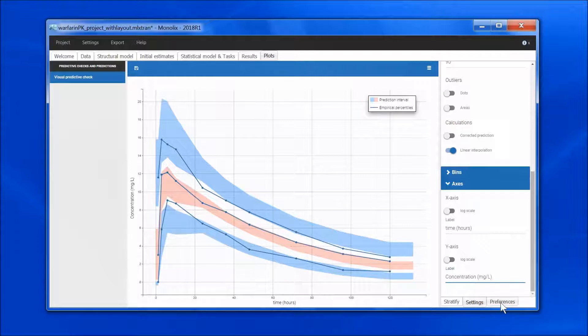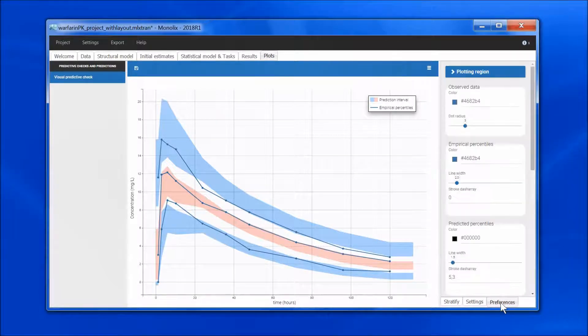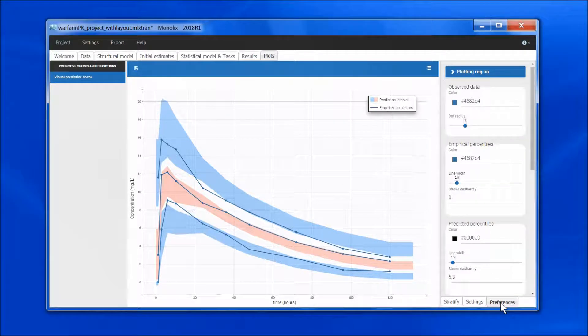In the preference tab, I can edit the colors, the line types, etc.